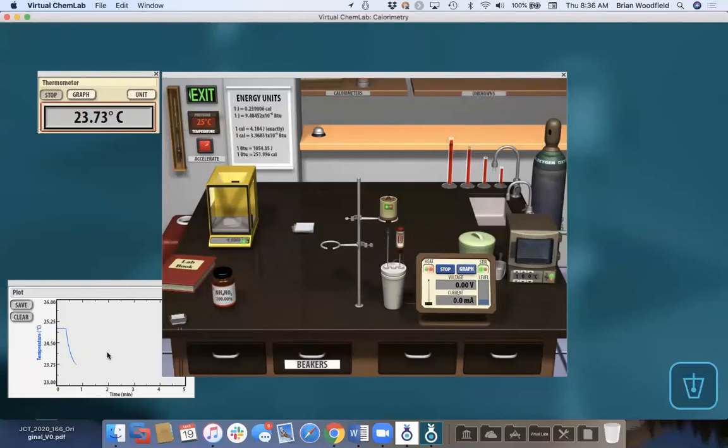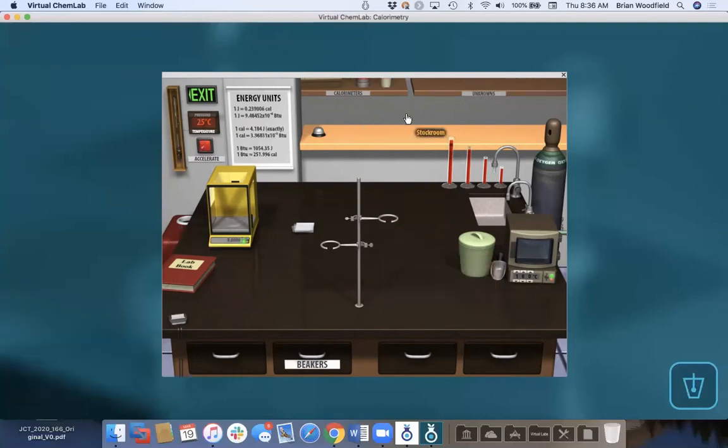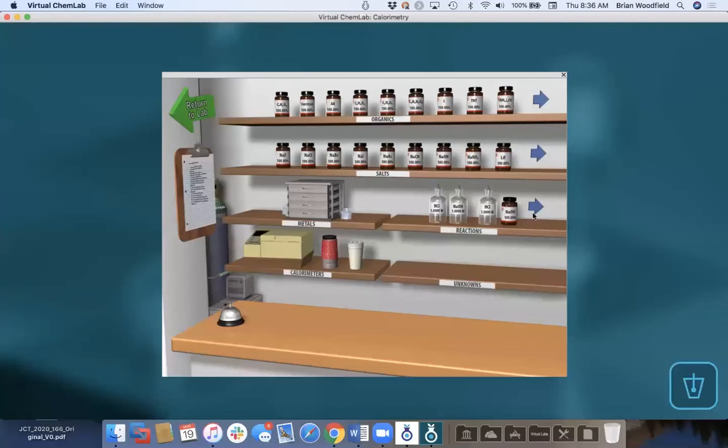So we have a great worksheet that talks about enthalpy versus entropy. But for a PChem, you wouldn't use the preset. You would just say, hey, why don't you build this and design this experiment for how you would do Hess's law. And it's not just these bottles. We have like 100 different bottles, I think, for measuring combustion calorimetry and heats of formation and things like that.